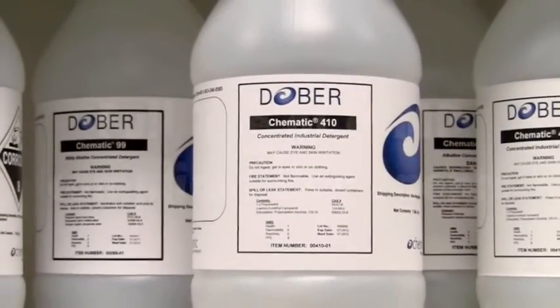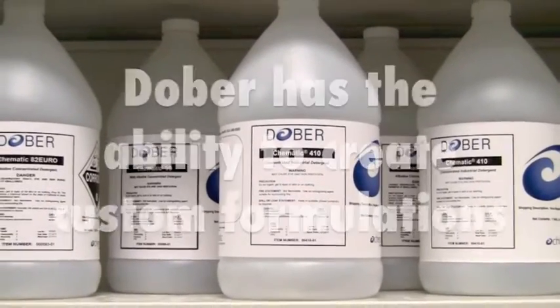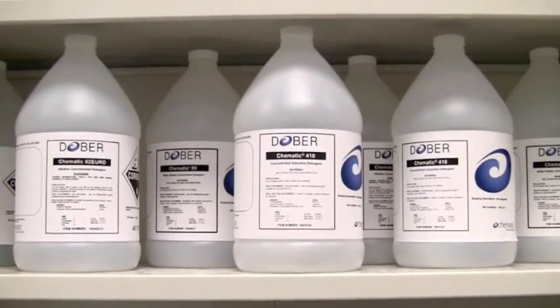With a full line of C-GMP compliant formulated detergents and the ability to create custom formulations when needed, Dober is poised to help with even the most challenging of residues.